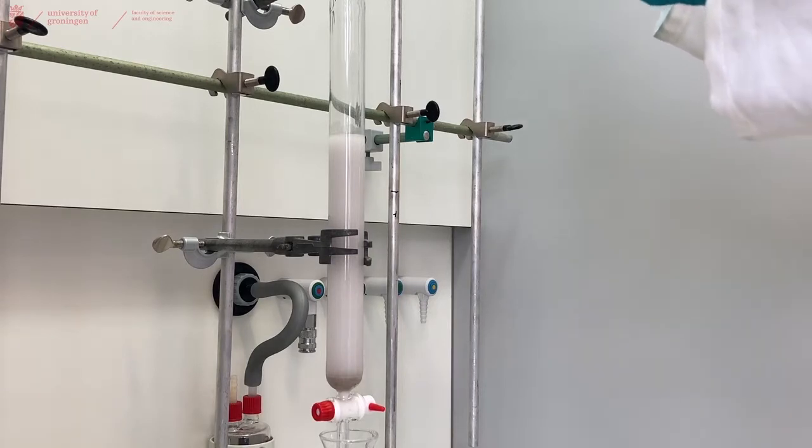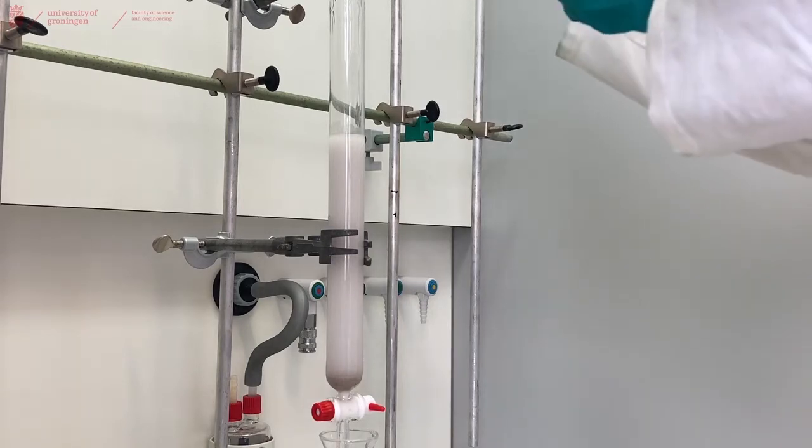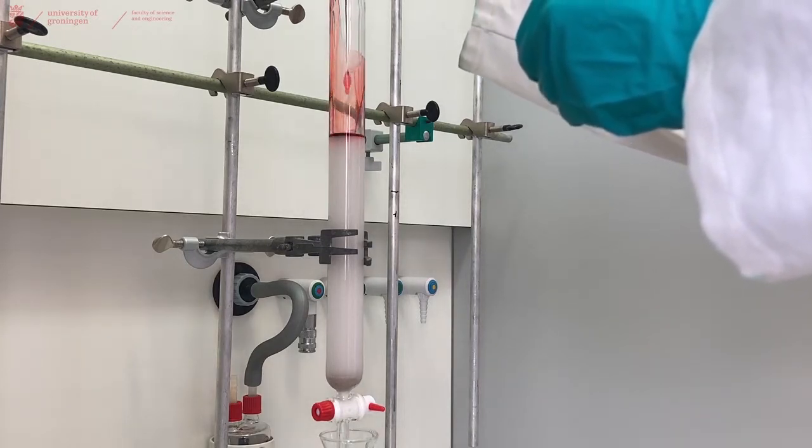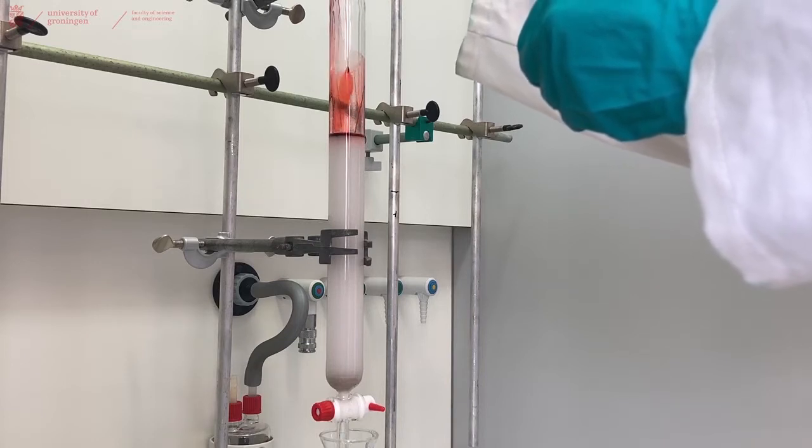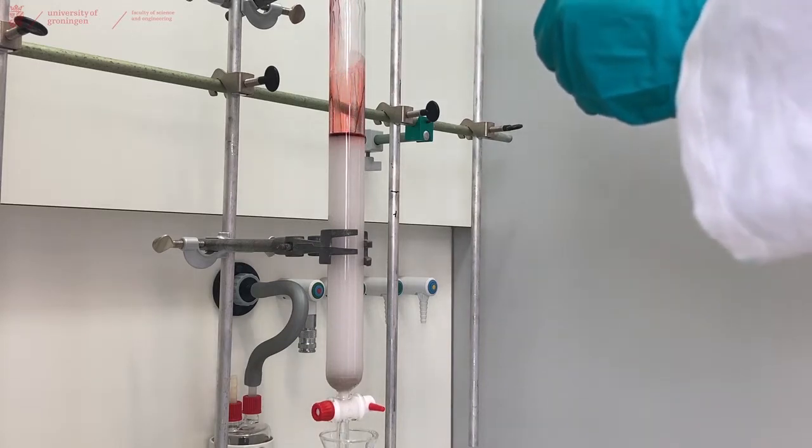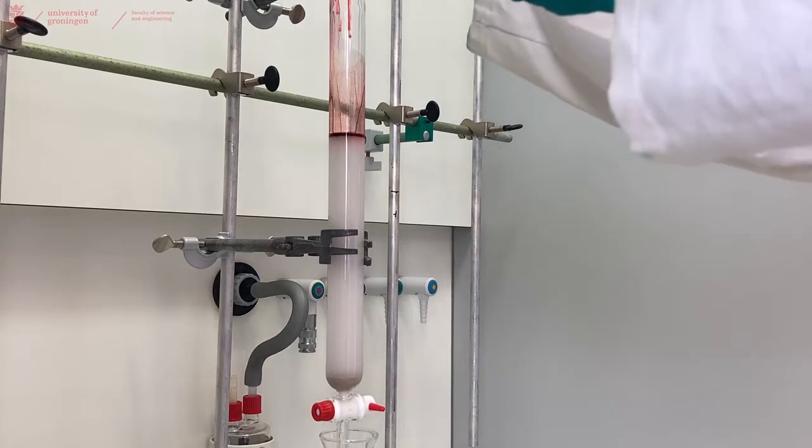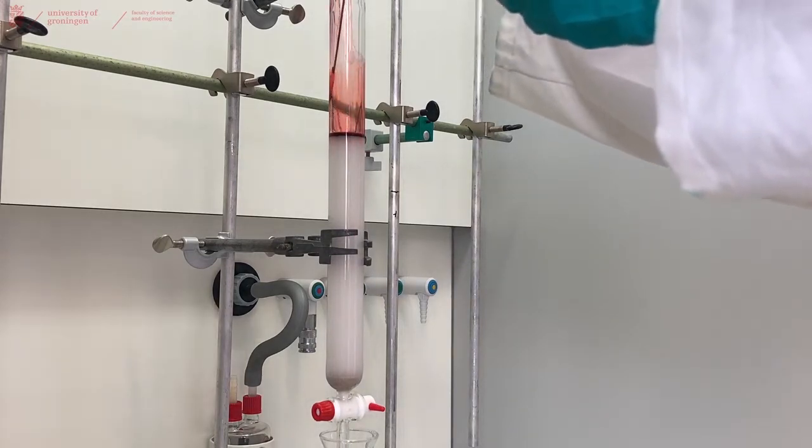And now we will place our compound on top of the column. We dissolved our crude mixture in a minimum amount of our eluent, and we will place a thin layer, depending on how much you have of course, on top of the column. Try to not disturb the top of your silica layer while doing this.